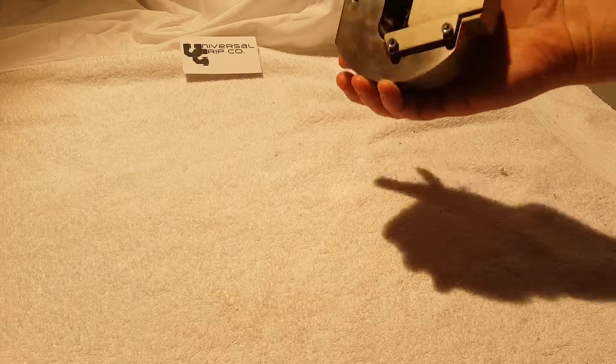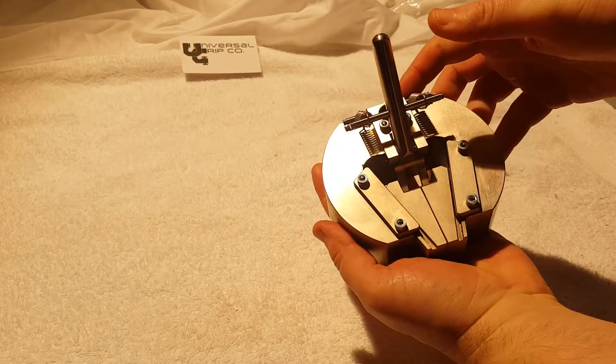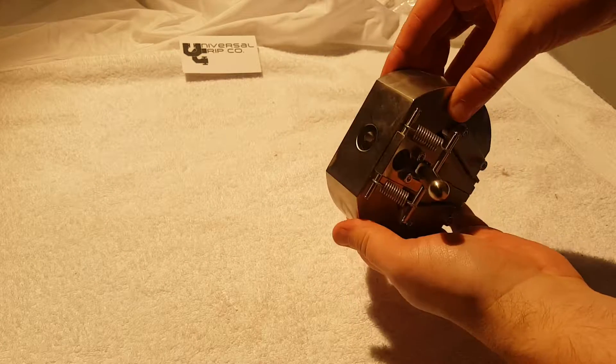Hello everyone, today we are showing our 10 kilonewton wedge grip. This is a simple tensile testing grip, one of the most popular ones out there.